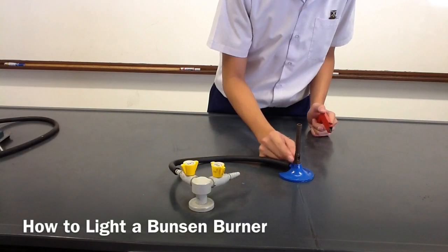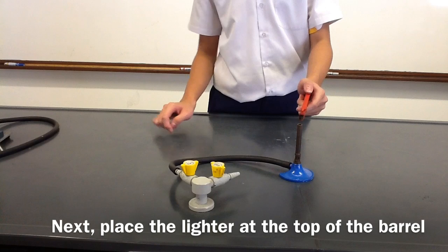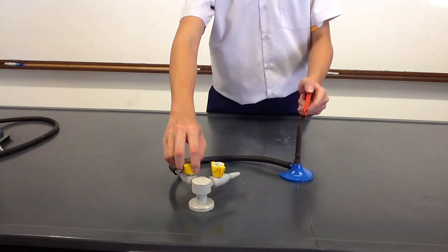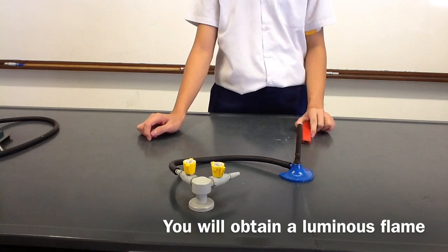To light a Bunsen burner, first close the air hole. Next, place the lighter at the top of the barrel. Turn on the gas tab and light the Bunsen burner. You will obtain a luminous flame.